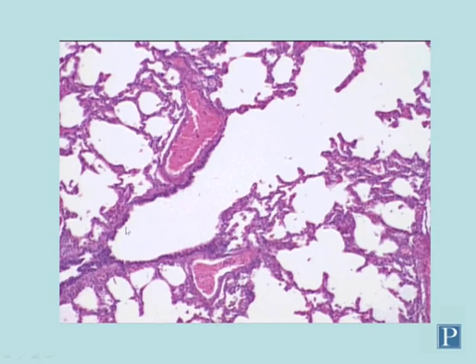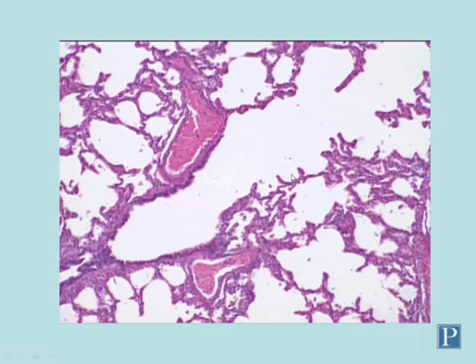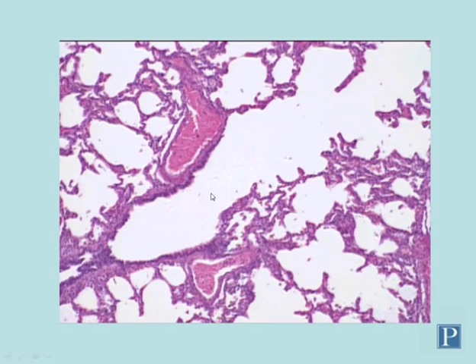Here we can see a terminal bronchiole transitioning into a respiratory bronchiole. You can tell this is a respiratory bronchiole because you can see walls of alveoli. Some alveoli, depending on how they're sectioned, show complete intact walls, but because they're very thin and three-dimensional, in many sections you only see parts of the walls. Here are three alveoli attached to this bronchiole, so this is a respiratory bronchiole. This is the terminal end of the conducting portion — classified as a terminal bronchiole because there are no alveoli in its wall.